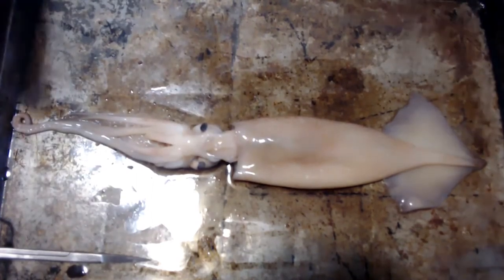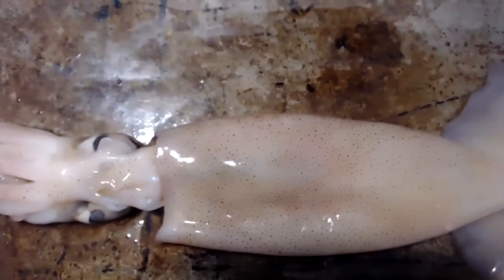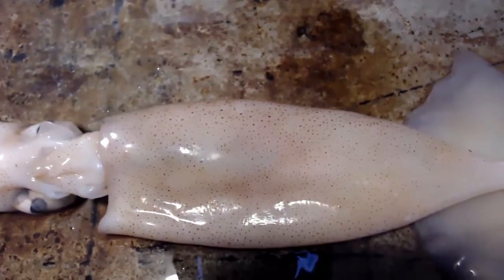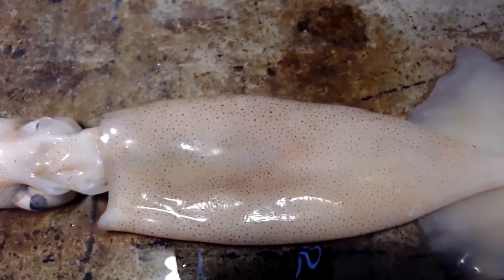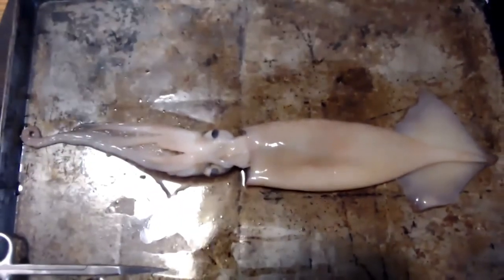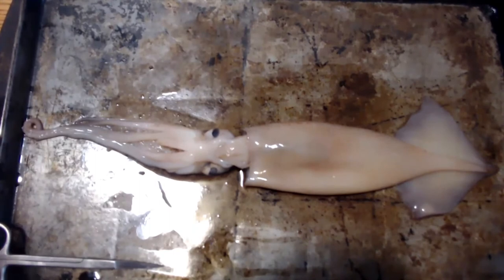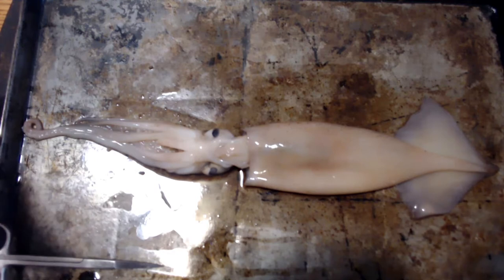I'll bring you guys up closer to show you the chromatophores. You can rub your finger against the chromatophores and they will actually start to activate — meaning they will start to move. I've been trying to do that lately and it didn't work out so well. You probably can do that if you catch them freshly caught, right off the bat. And once they die, you'll really be able to see the chromatophores start to move. It's truly amazing.